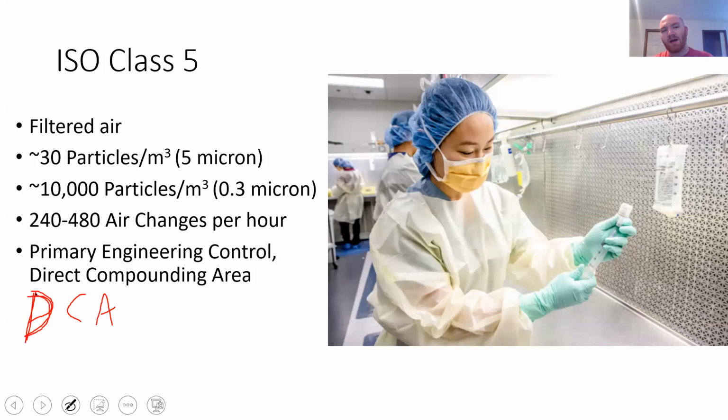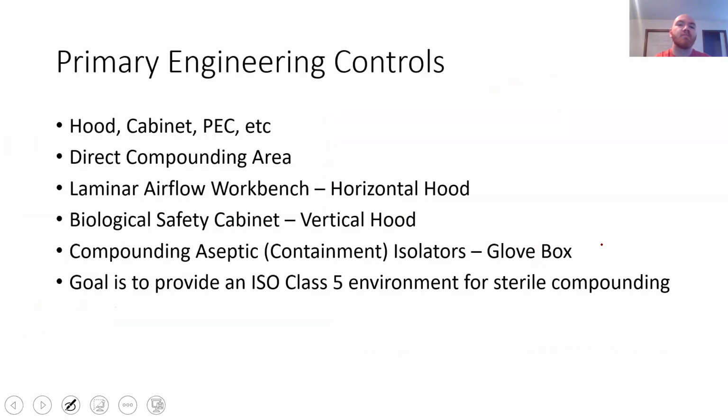So here we have these requirements. And you can see that this person is doing something very bad here. Don't do it like that. I believe you've touched on this in your lab section. Do not block your first air. But this is the cleanest environment that you'll find in a hospital.